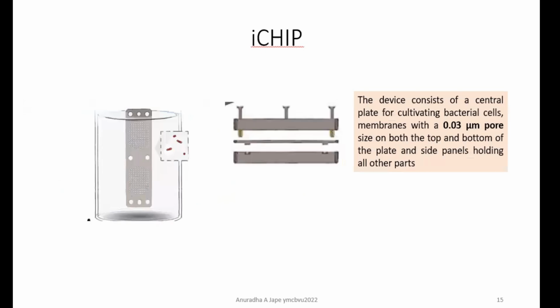This is an even higher version, which is referred to as iChip. Introduction related to this we had discussed in the previous lecture also. So different approaches out of this, if you see, here is a metal chip, right? And if you are able to see, there are fine pores, more than 300 pores on this particular small chip, right?